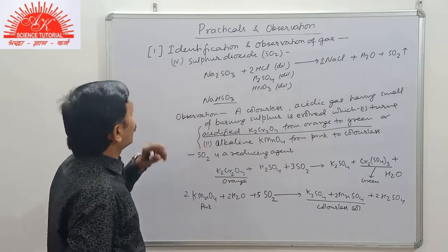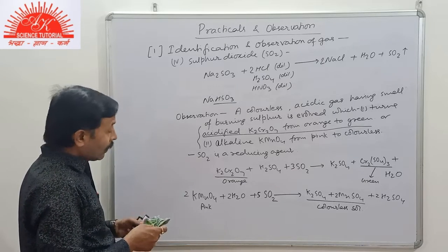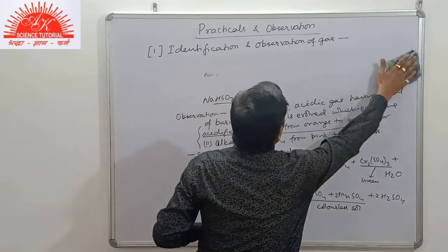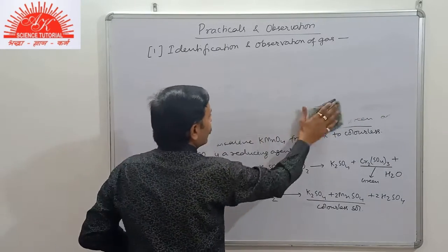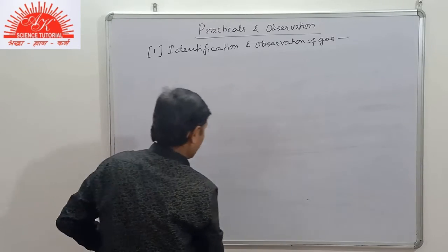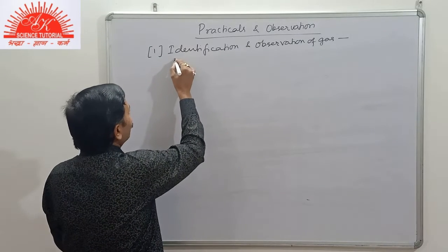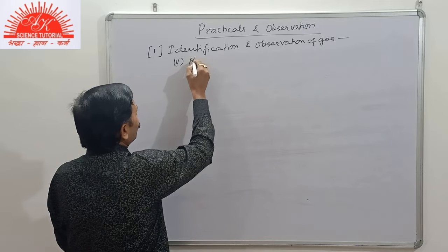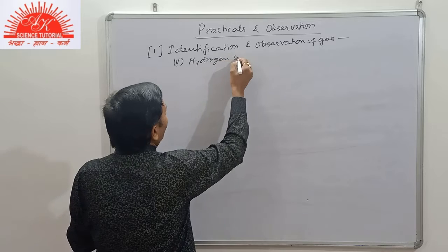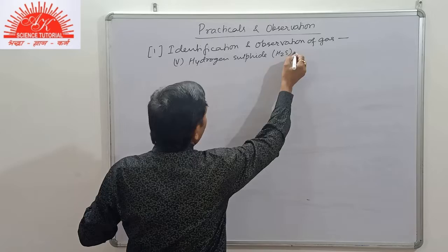Now students, we have studied 4 gases here. Now the next gas. The next gas is hydrogen sulfide, that is the 5th gas, H2S.